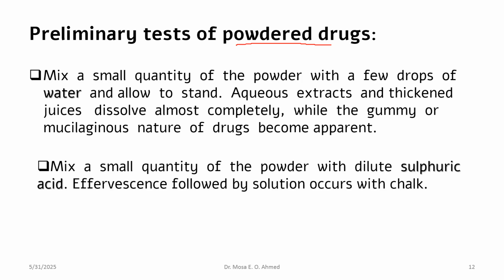One of them is mixing the powder with a few drops of water and allowing it to stand, and we note the nature of the powder. If it contains gums, the appearance becomes more homogeneous or viscous in nature.